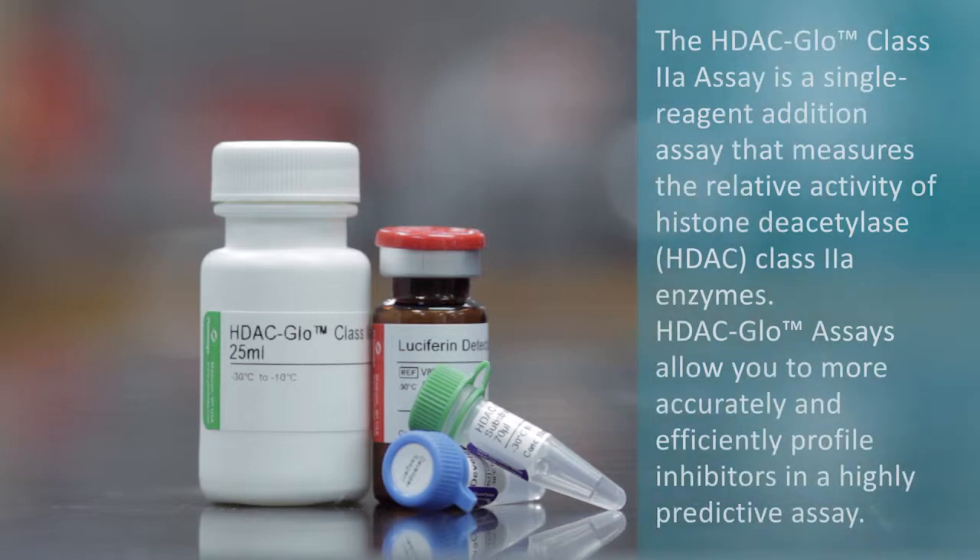The HDAC Glow 2A assay is a single reagent addition assay that measures the relative activity of histone deacetylase, or HDAC, class 2A enzymes. HDAC Glow assays allow you to more accurately and efficiently profile inhibitors in a highly predictive assay.